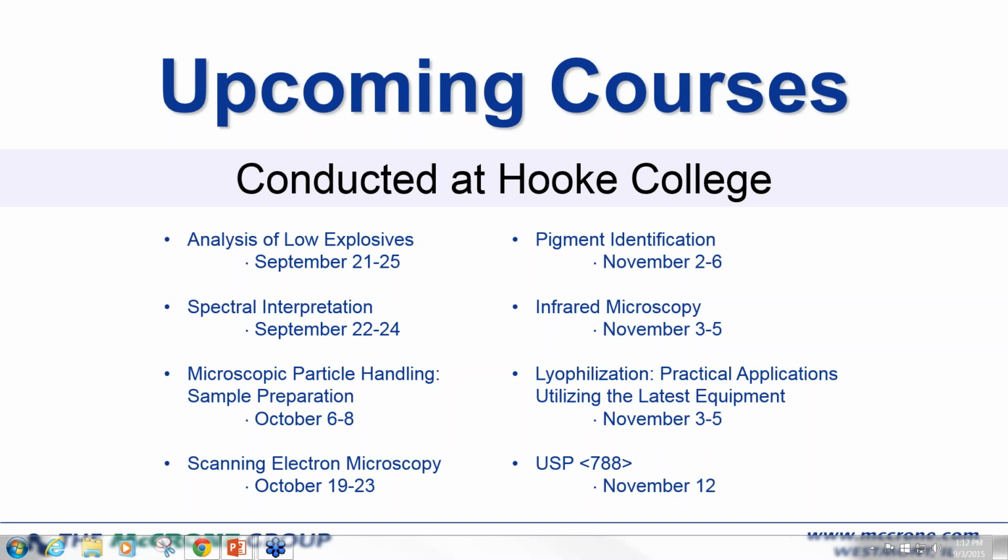First question, why did you use transmission IR rather than ATR? I'm very glad you asked this question. I didn't get a chance to talk about it too much in the webinar. ATR is another technique for obtaining your spectra, and it's very useful for deformable materials like rubber, although it isn't so great when you have heavily carbon-filled rubbers.